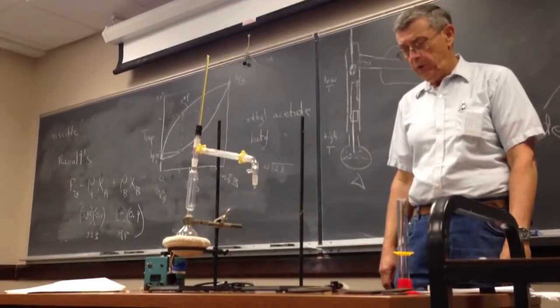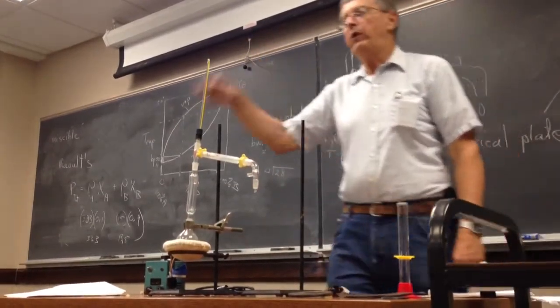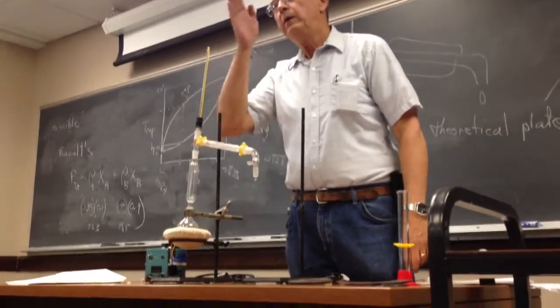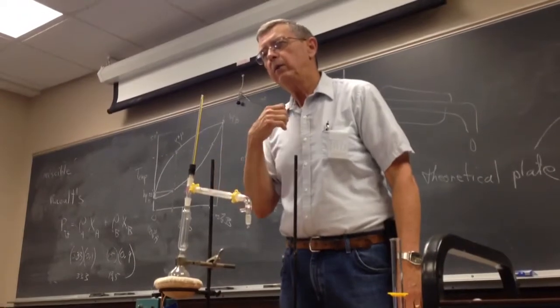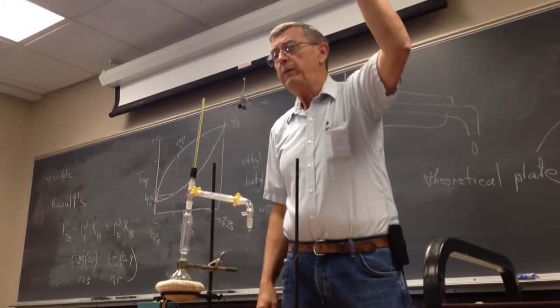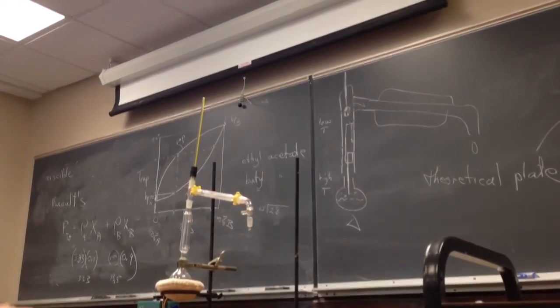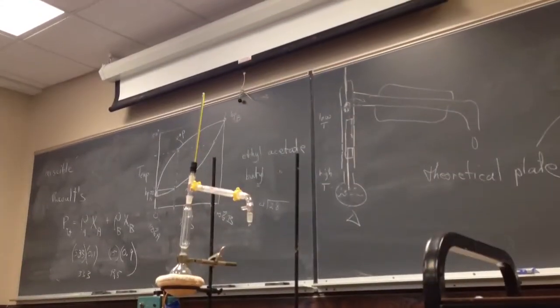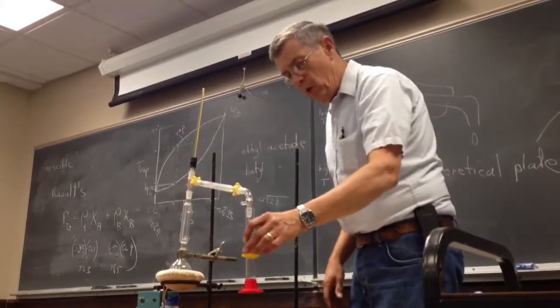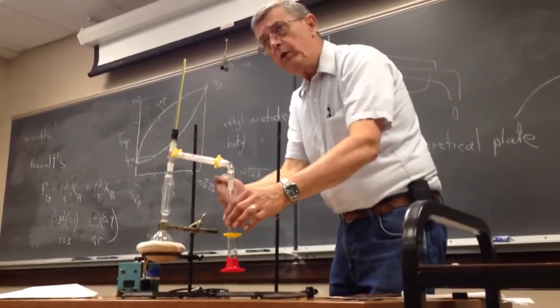If you look at what the experiment's going to be, we're going to follow the temperature every 2 milliliters throughout the distillation. So I need some way to measure the volume that's coming over. A 50 mil graduated cylinder. Oops, where'd it go? I need it. I got it. I'm going to want this over here, so I can measure each 2 mils that comes over.